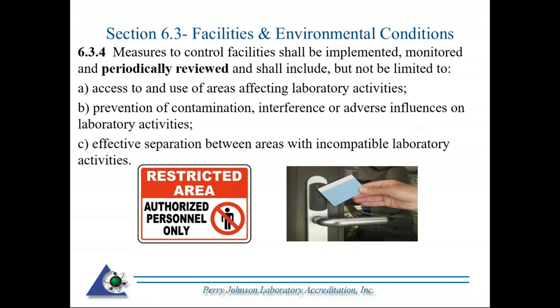And sort of depicting here access, it's up to the individual organization to set the parameters for access, perhaps a locked door or, for more critical testing calibrations, perhaps some sort of scanning device may be needed. Shall include, but not limited to, prevention of contamination, interference, or adverse influences on laboratory activities. Hence, it should have no cross-contamination or perhaps electromagnetic frequency that could affect equipment. And of course, effective separation between areas with incompatible laboratory activities.